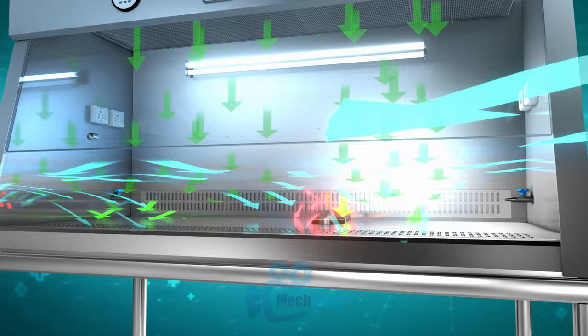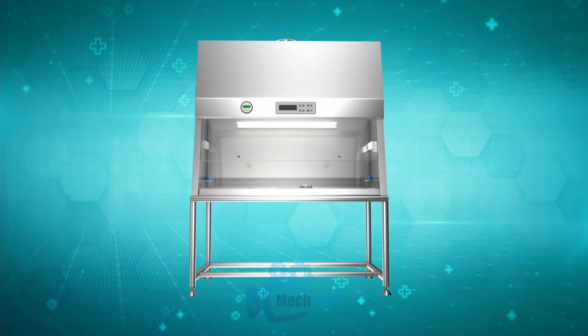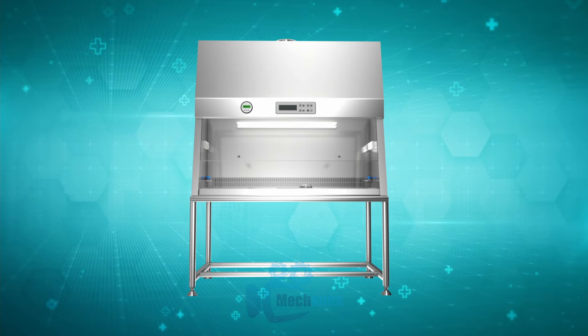The air supply to the inside chamber protects the researcher by forming an air curtain on the front space of the biological safety cabinet. In this way it provides three protections: safety of researcher, safety of sample, and safety of environment.